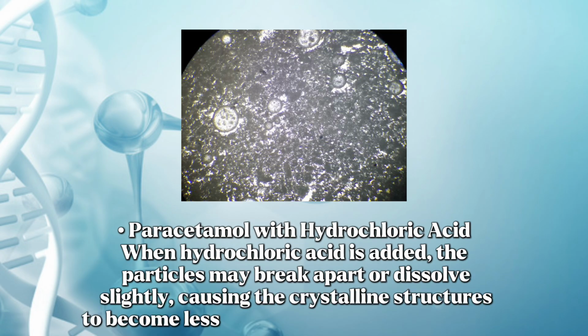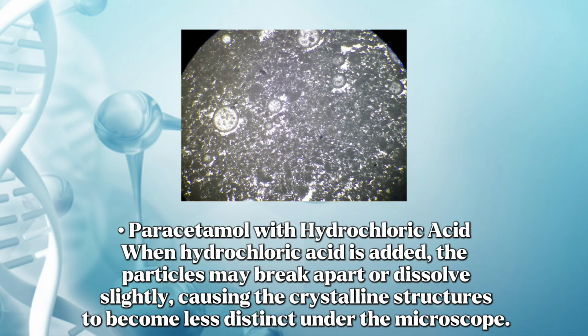Paracetamol with hydrochloric acid. When hydrochloric acid is added, the particles break apart or dissolve slightly, causing the crystalline structures to become less distinct under the microscope.